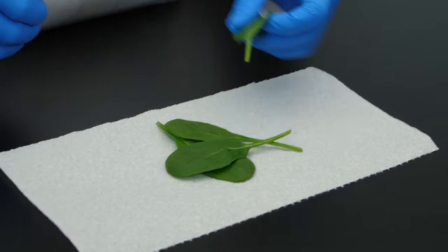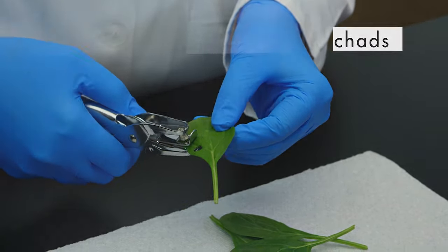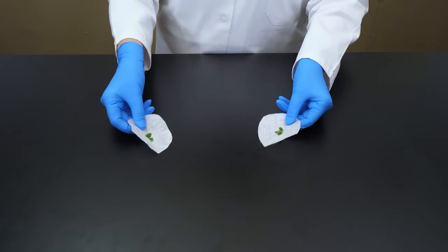With a hole punch, we punch tiny round pieces, called chads, from the leaves. We need 20 chads for this experiment.